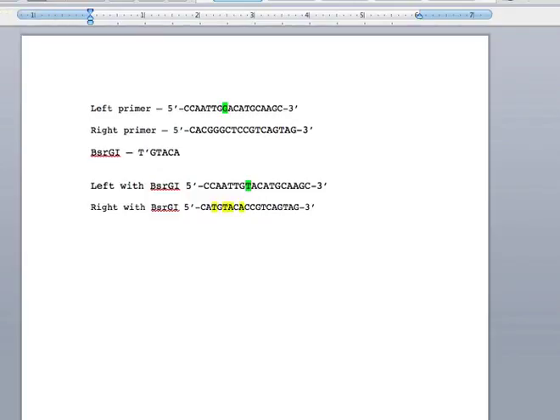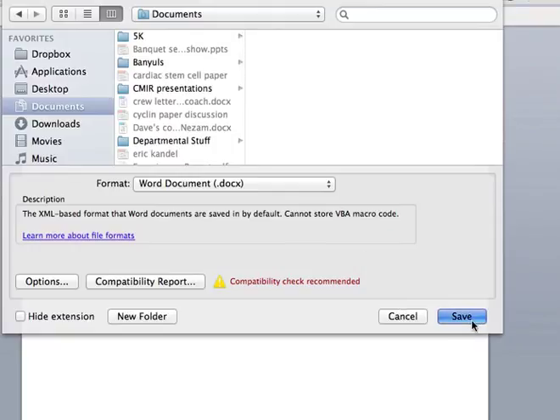there. So we had to make 4 nucleotide changes, and I'll reflect them up here in the original sequence. That had to be changed to a T. That G was changed to a T. That was changed to an A. Oops, I didn't mean to do that. That G and that T. Now you might be a little bit confused, but just forge on ahead. All we've done now is take the original sequence and then make changes to make primers. Okay, let me save this real quick.